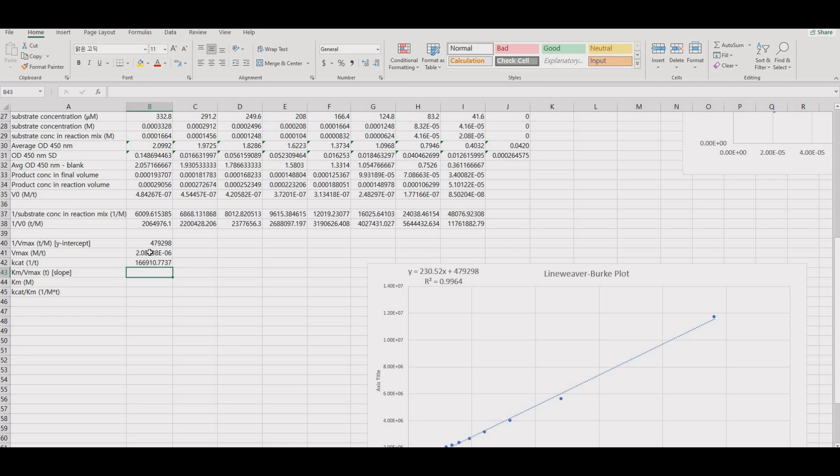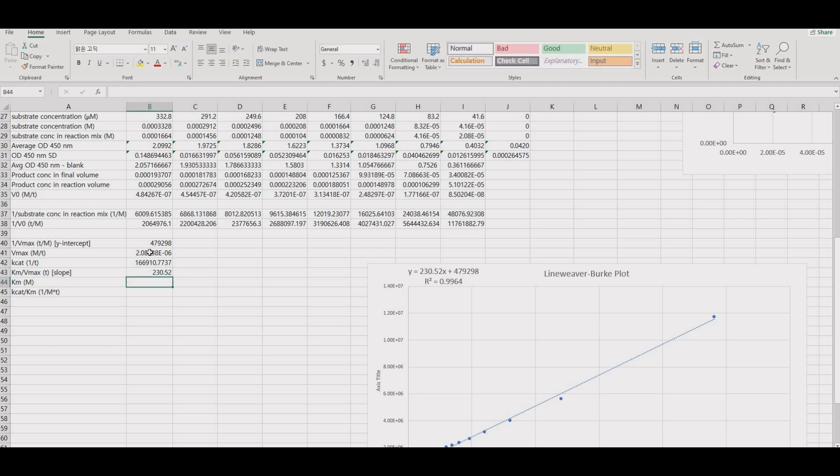The slope is Km over Vmax, and so use the previously calculated Vmax to get the Km.